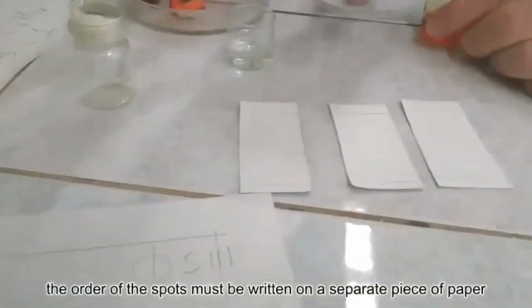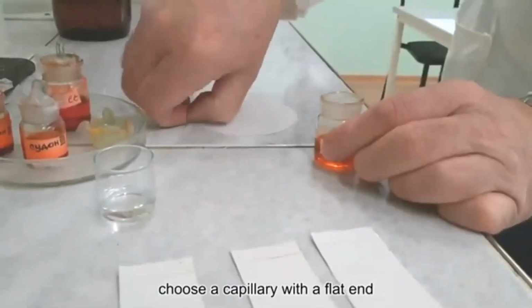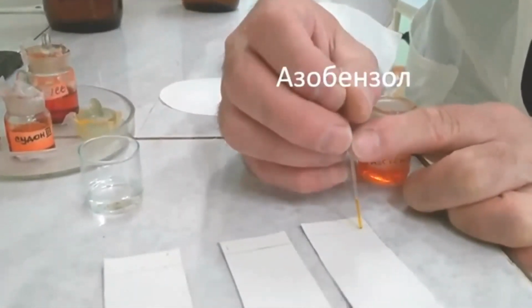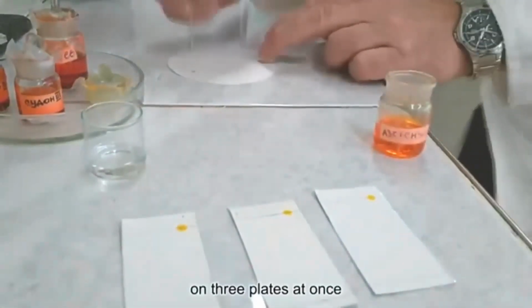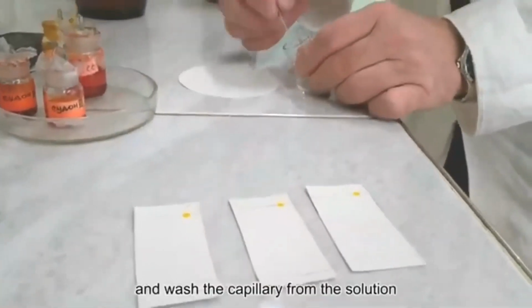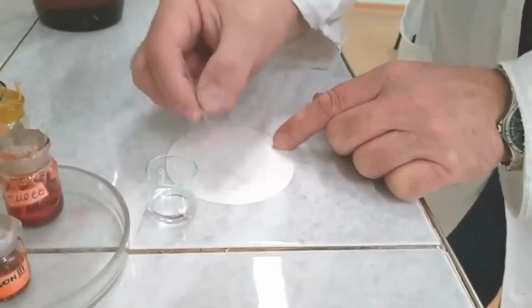Берется для этого дела капилляр, более-менее приличный, с ровным торцом. Сломанный торец должен быть ровненьким. Набираем. Оп. Вот он схватил. И так более-менее уверенно. Ага, не хочет. Вот так. А вот так. Нанесли избыток на фильтр. Вот и закрываем. Промываем. Вот таким макаром. Окунаю быстренько туда, на фильтр. Это чтобы не использовать 20 капилляров.